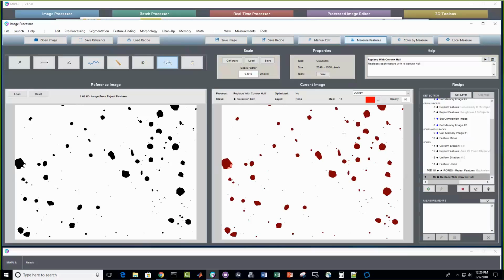It's all just about the image, how you've acquired it, and whether your image has sufficient feature resolution in order for you to make measurements to the standard that you need to make them. So there really is no size limitation to features that we can detect. It's all about capturing objects based on their pixel characteristics. But thank you for the question.